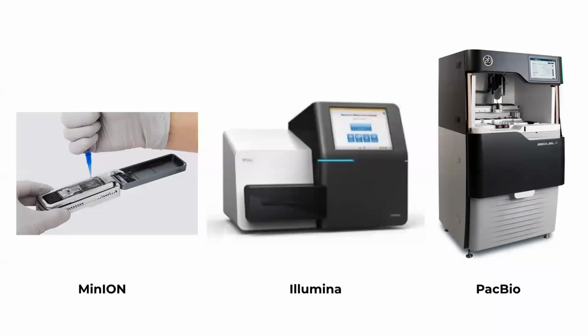Now, in terms of sequencing, the way to prepare that data, right? When we take that data out, we then have to produce digital information about the sample that we have. Since we're looking at the genetic material, we need the sequences of DNA or RNA that is present in the sample.